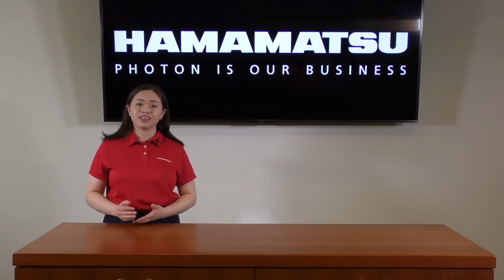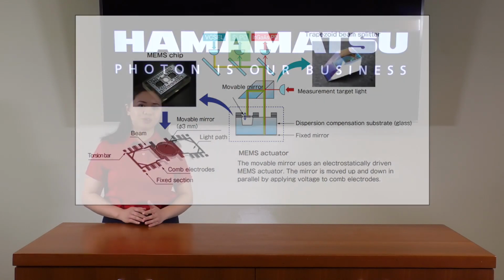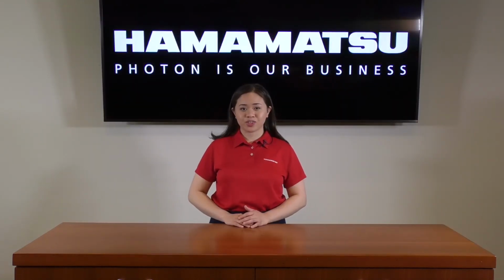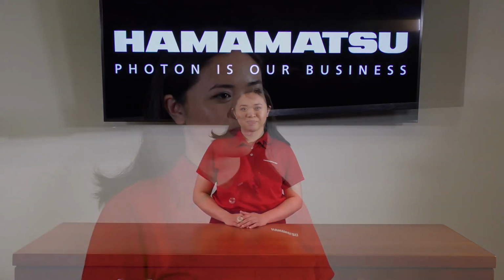Simultaneously, a laser interferometer is used to track the position of the movable mirror. In this case, light from an internal VCSEL travels through the beam splitter to the movable mirror, is reflected back to the beam splitter, and the light is then detected by a silicon photodiode. Our free evaluation software provides the controls necessary for the FT-NIR engine to perform these actions in parallel, and the information gathered by both photodiodes is then collected.